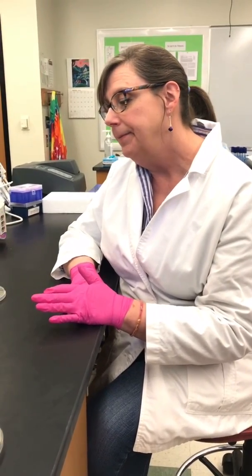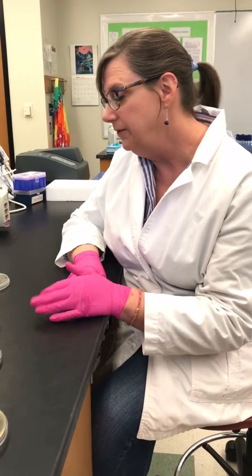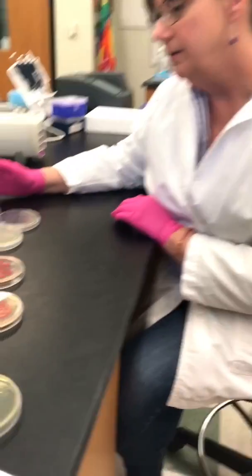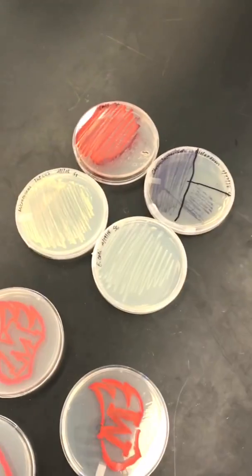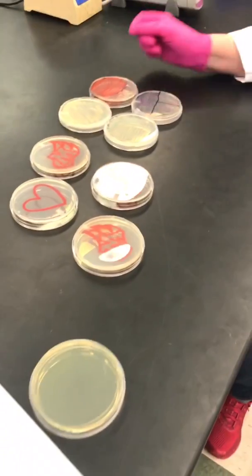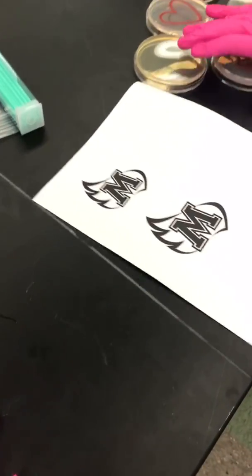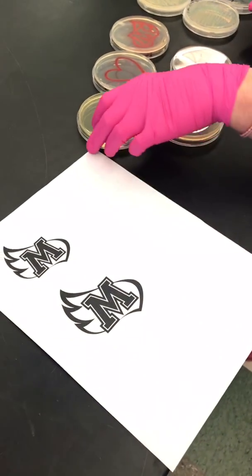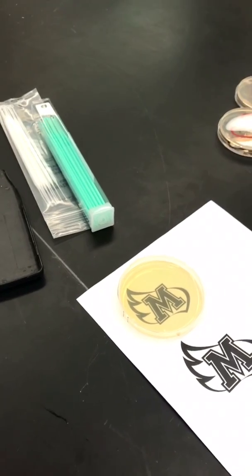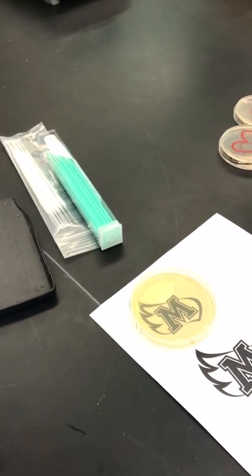So these are just some examples of what I've done, and these are examples of some of the bacteria that we have here at Meredith College that can be used for Agar Art. And so basically you can either take cells from these plates and do a freehand shape, or you can take a template that you print out and then just place an agar plate on top of it and trace over it with your bacteria that you would write with on a loop.